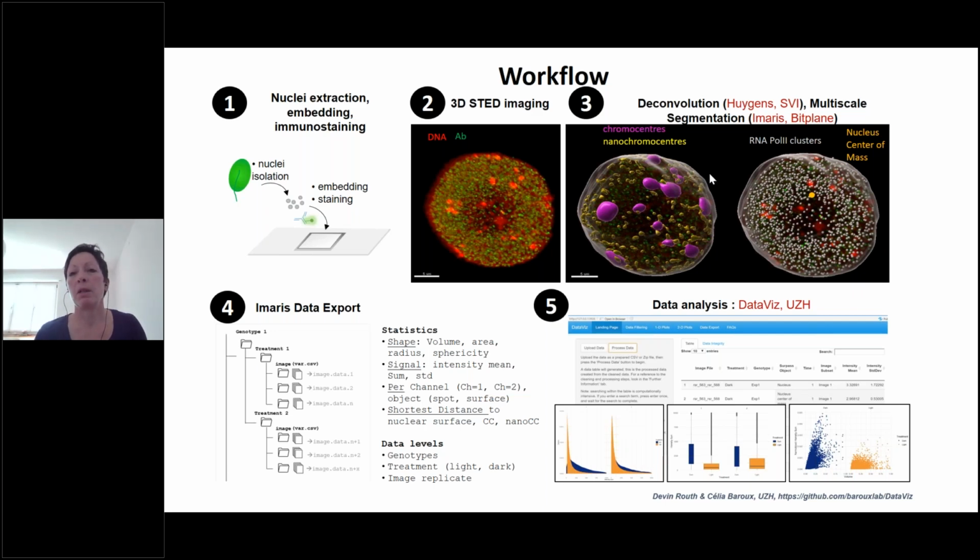So in this webinar, I'm not going to teach how to use the software, because the company has developed very well done tutorials. Online you can find all the introduction and how-to tutorials to segment your image. And INDEPTH has already provided a training school. But the end effect is that we now define the nucleus as an object with a boundary, which is this gray transparent envelope.